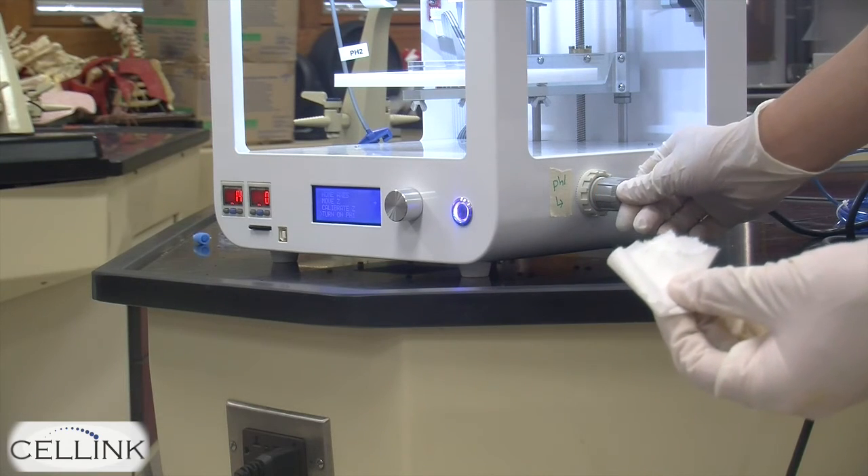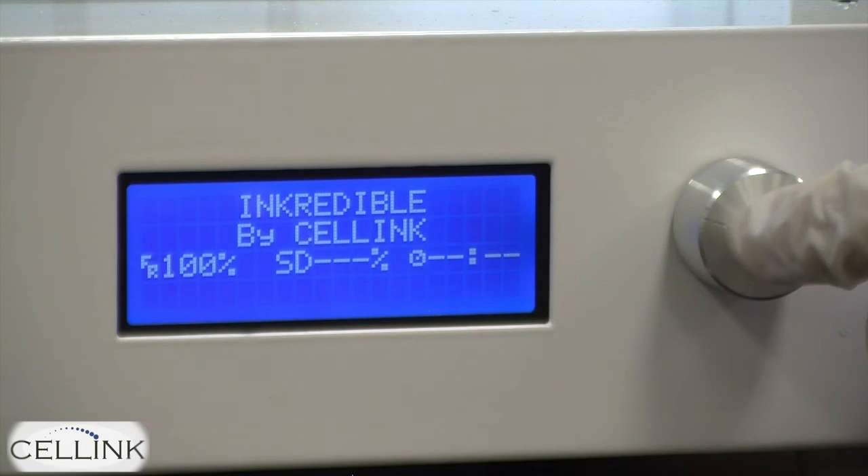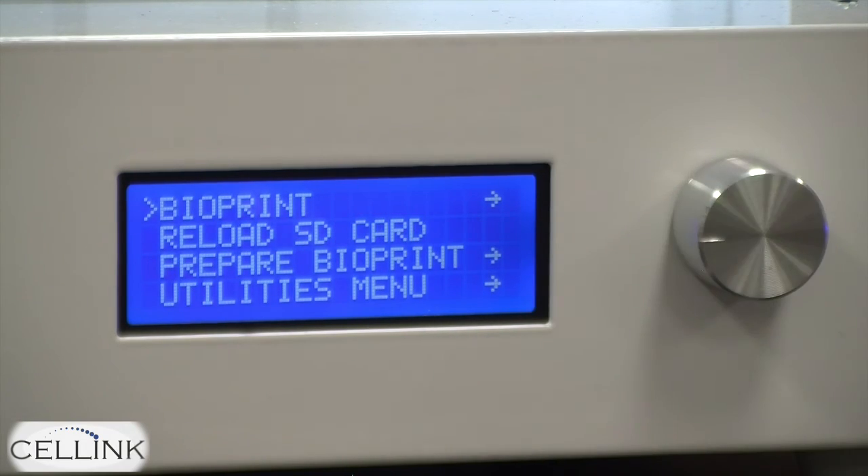Lock the print head one nozzle in place to keep the pressure constant, and then return to the home menu and begin bioprinting. See you all again next time.